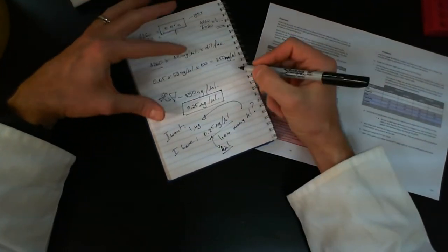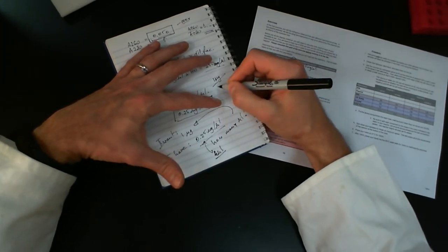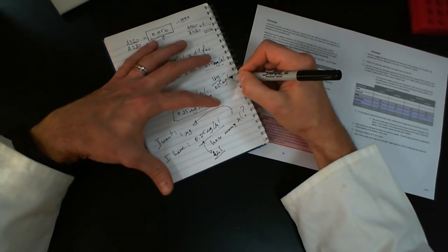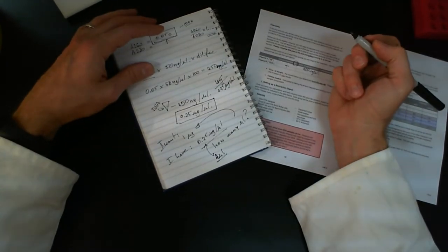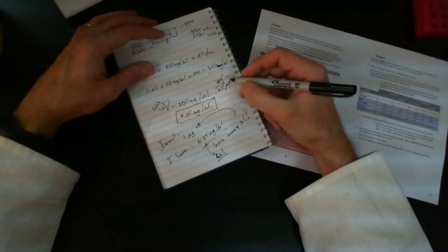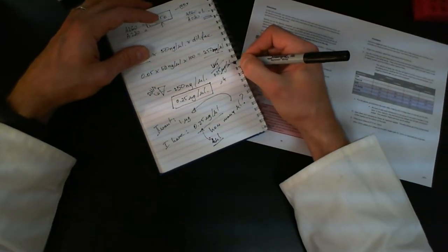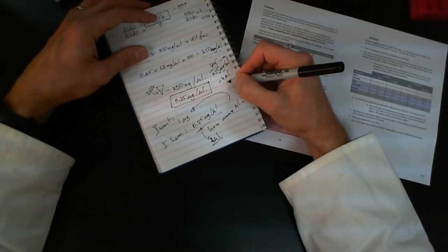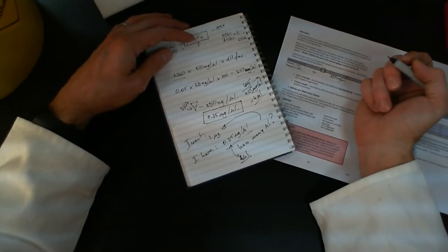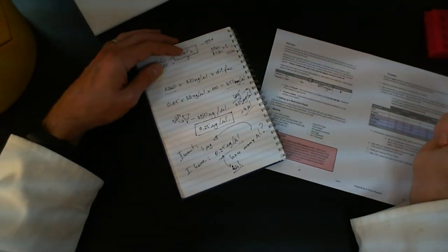The way you figure it out is you take the 1 microgram that you want and divide that by what you have in terms of concentration, 0.25 micrograms per microliter. The micrograms cancel out, and you have 1 divided by 0.25, which gives you 4. The microliters, because they're in the denominator of the denominator, flip over into the numerator, so the units here will be 4 microliters. That's the big scary math, which means the volume I would need is about 4 microliters of my DNA sample.